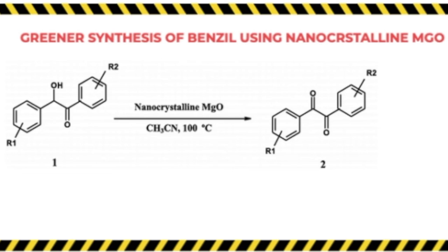For this reaction, we were able to take the same reactant, use different methods for the mechanism and the synthesis of Benzil, and still come out with the same product known as Benzil. And that within itself is what this module in our organic chemistry class was all about. And it's been the message of our class for the duration of the semester, to be able to take a reaction, see how harmful it can be to our environment, and see if there's an alternative.